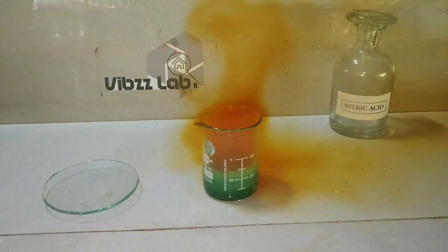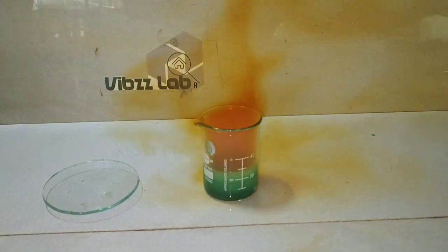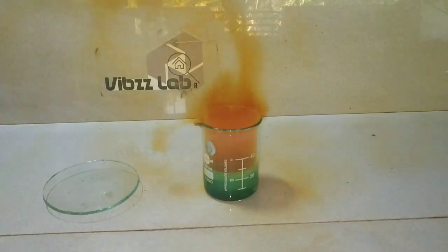Observe how vigorous the reaction is taking place. This is very similar to how a piece of copper metal would have reacted with the nitric acid. There are dense brown fumes of nitrogen dioxide and the solution has turned bluish green in color.